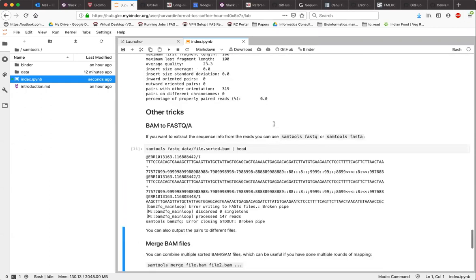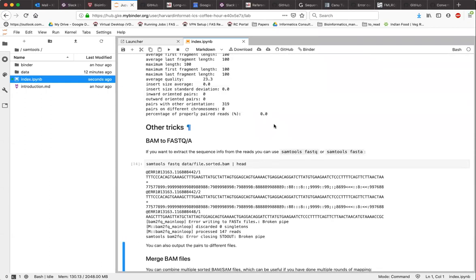Okay, yeah, that's about it. That was rather quick, but hopefully it gives you some idea of how to begin tackling these files.